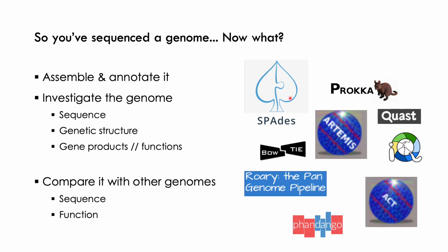On the right here, I've got a few really commonly used tools, and I'll touch on most of these. Some of these are command line tools, which require you to have a little bit of coding experience. You use the terminal and type scripts in, or rather you might learn to do that as you go, as I did in my PhD, and I know a lot of other people had the same kind of pathway. But some of these tools also have graphical programs that have a much less steep learning curve, and some of these are really useful for visualization as well. But all of them are really commonly and frequently used tools in the microbial genomics space.